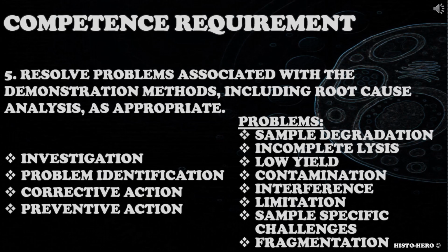The fifth competence requirement is resolve problems associated with the demonstration methods, including root cause analysis, as appropriate. Candidate should be able to troubleshoot demonstration methods. Does the candidate resolve problems with demonstration correctly? Can they identify and solve the common problems? Can they record problems and resolutions accurately? Can they perform root cause analysis?